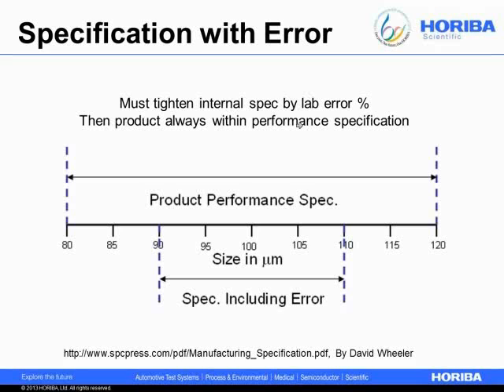In the case of Trona, as I talked about, converting a needle-shaped unmilled Trona material to a hard sphere has some built-in error. So when you set your internal specification, not the external specification, the internal specification should build in the lab error. And then when you set your external specification, it should always be wider in terms of size, both finer and coarser than.